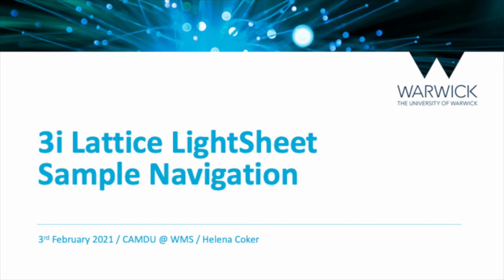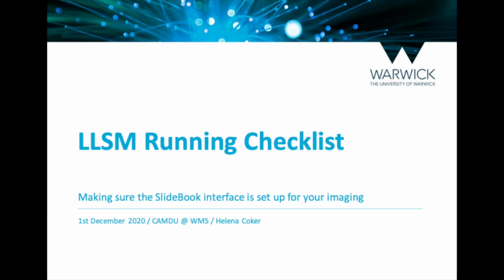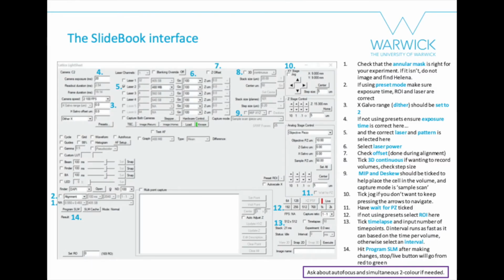This tutorial will guide you through the SlideBook window as at version 0.22 and how to navigate around your sample. Please get the running checklist from the training materials section of the website for reference. First, we will use this checklist to ensure the window is set up correctly for imaging.